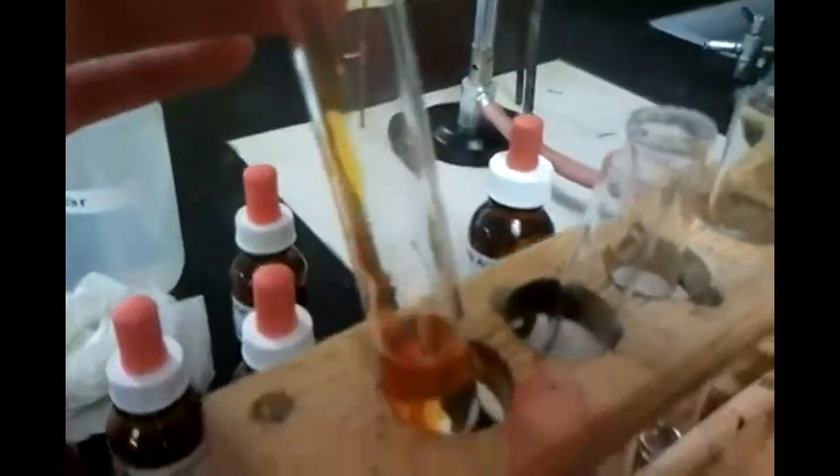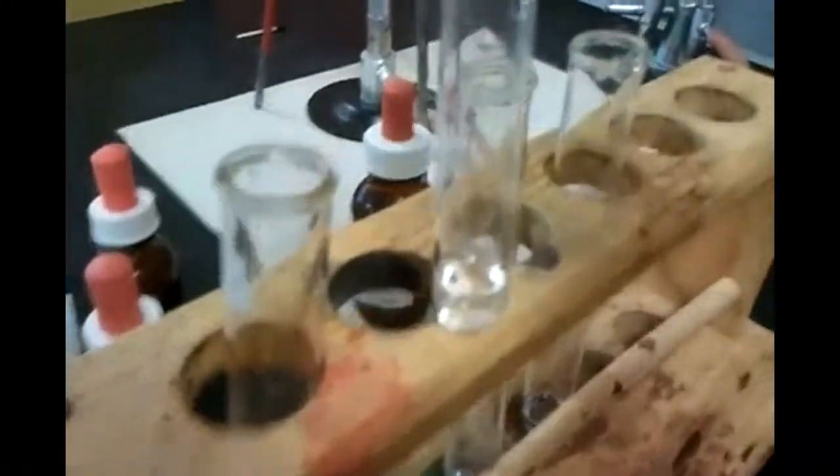We're doing the same thing again using methyl orange indicator. It's very orange. Now we're putting it in water — it's still orange. This is sodium chloride — methyl orange going in — it's still orange.